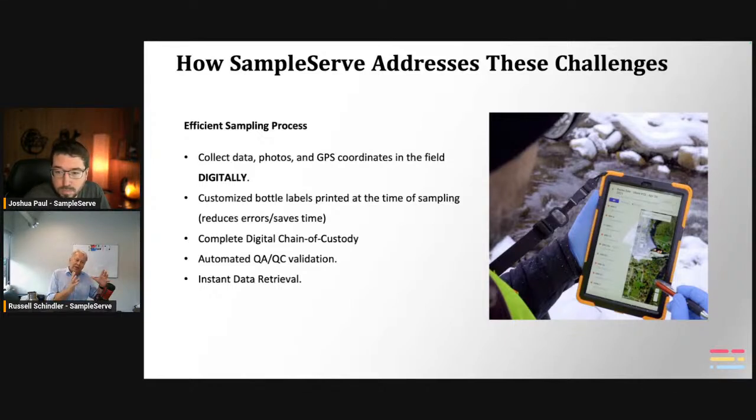It's going to really lock that in, so that the chain of custody then goes all the way to the laboratory. You go through that same process if you're going to transfer custody. So if I gave my samples to Josh, I would go through the process of relinquishing, and then he would go through that process accepting the custody, and then the same thing happens at the laboratory as well. Or if you ship via FedEx or UPS, you're just going to indicate that you dropped it off. There's a mechanism for all that third-party, commercial carrier to get it to the laboratory as well.